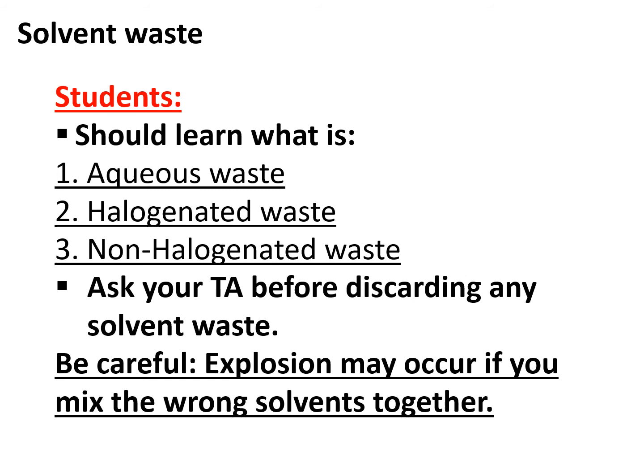Because if you put something, especially if you put a lot of organic things into an aqueous waste container, there's an explosion chance. There's a lot of gas that can be produced in vapor. It could be acidic. That's how one of our TAs lost their eye about 5 or so years back. So big problems, you got to make sure. So always ask if you're unsure.